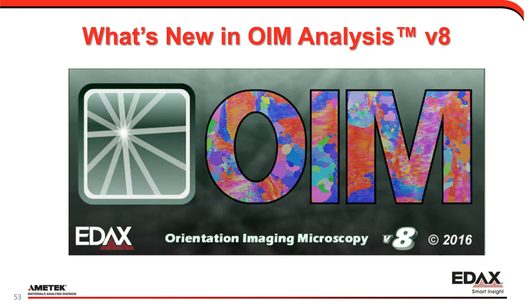And with that, we'll shift gears to the second part of the webinar, which is what's new in OIM Analysis 8. This is a product we announced at M&M, I think it's still last month. It may have been a little bit more than a month. It might have been in late July. This is a product we aim to start shipping here in Q4 of this year. So my guess is probably going to be November is when it will start shipping from the factory.